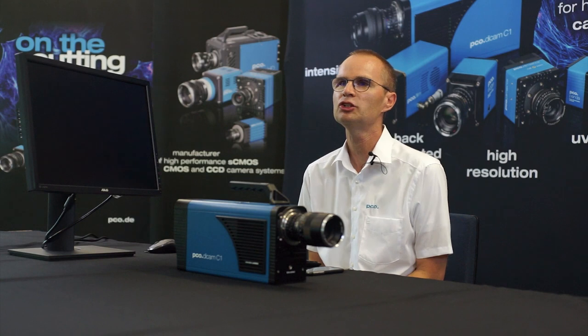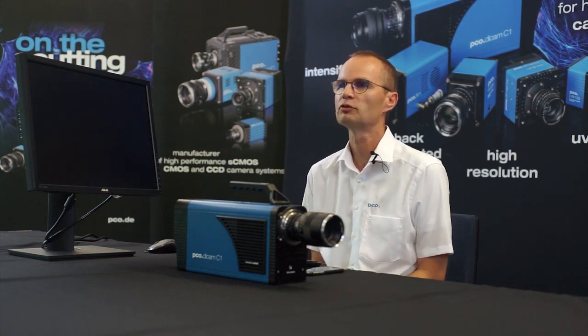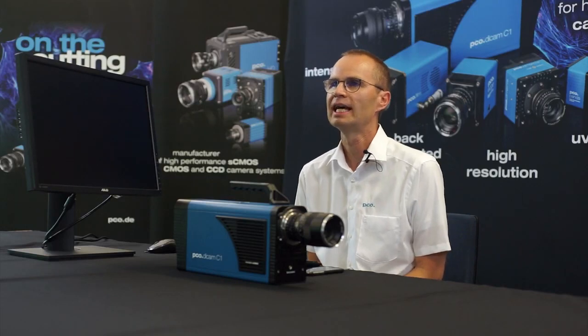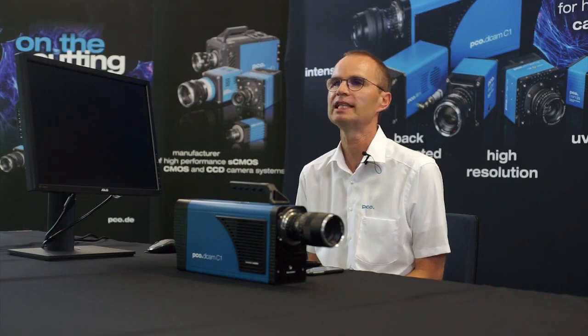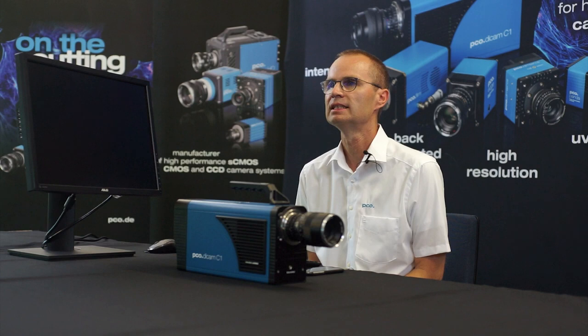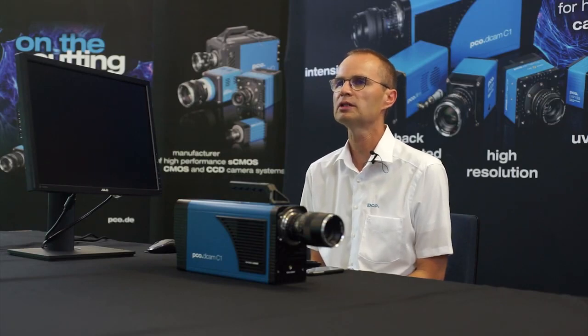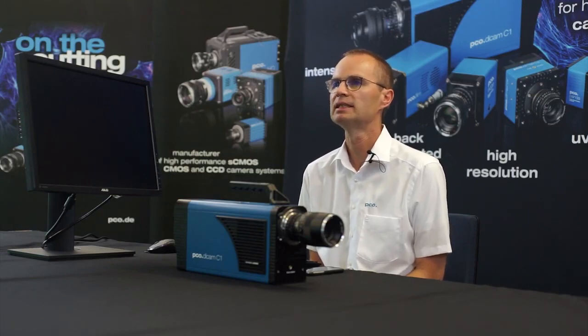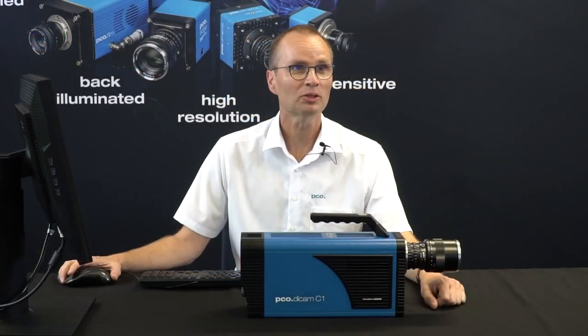Image intensifier tubes use a three-step wave for their intensification job. They convert photons into electrons, amplify the electron signal, and finally reconvert the electrons back into a photonic signal. To achieve this, an image intensifier tube consists of three main functional components: a photocathode, a microchannel plate, and a phosphor screen. So let's have a look at this principal drawing.